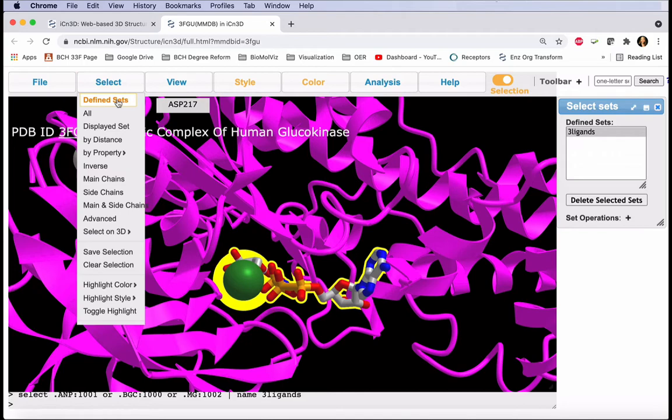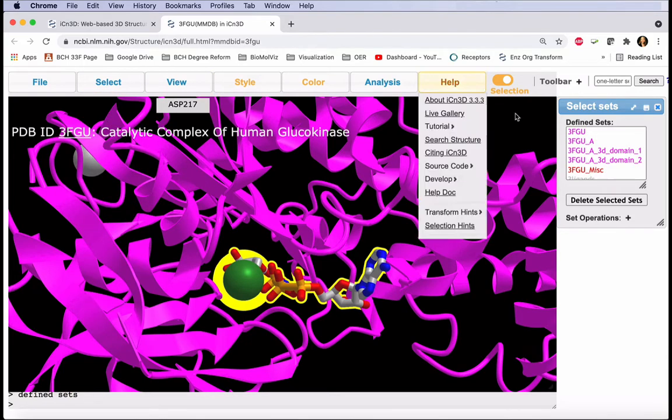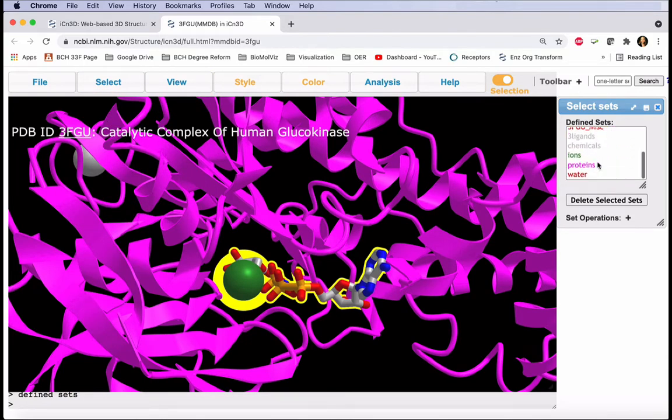There are other defined sets, so if we go to the Select menu and click again, we'll see a longer list of presets, but our Three Ligands is also here.